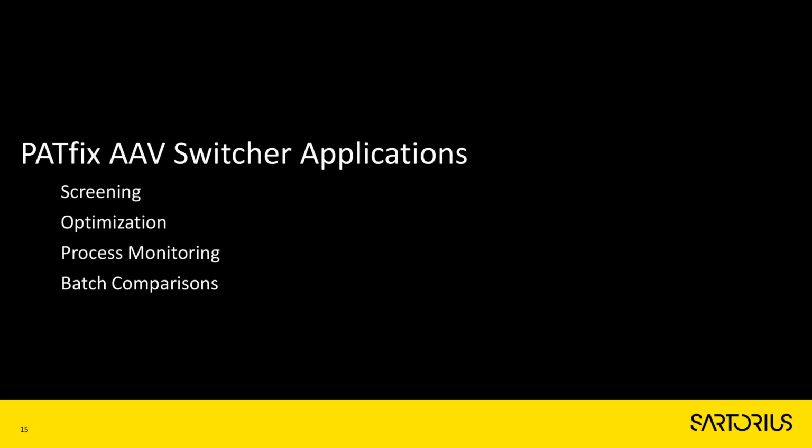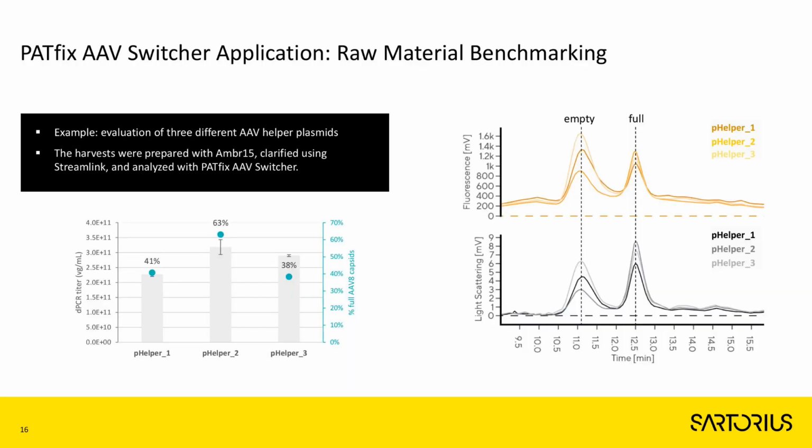So for that purpose, we were very happy that our colleagues have developed AAV Switcher, and we decided to test it for different applications. Those applications being screening of raw materials, some optimization experiments, and later I will show process monitoring and also comparisons of some batches that we have produced.